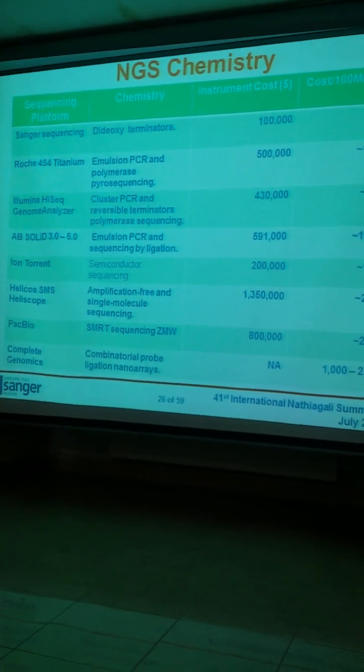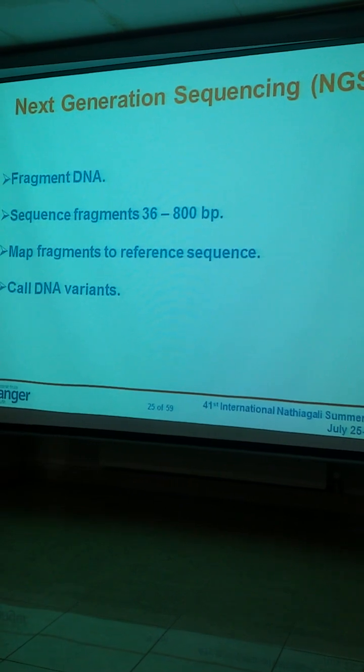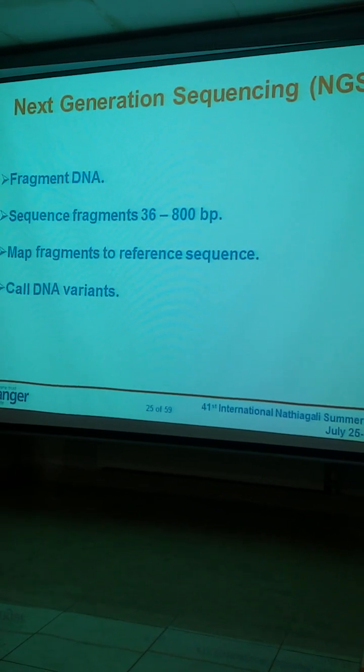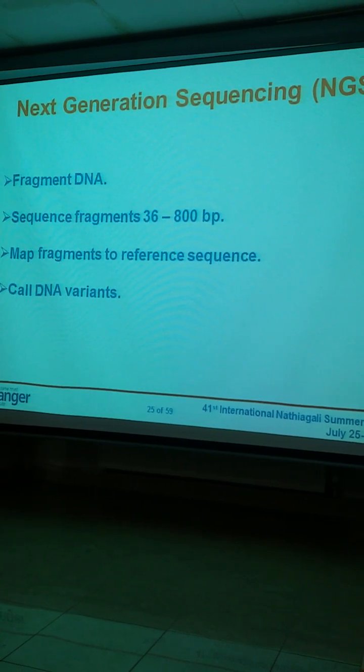Dr. Al, can I ask a question about that? Yeah, sure. When you do this sequencing, is this all done automatically, or do you have somebody working on it? So we have a core sequencing group at Sanger, and they actually do the library preparation. There's a group which does the library preparation.